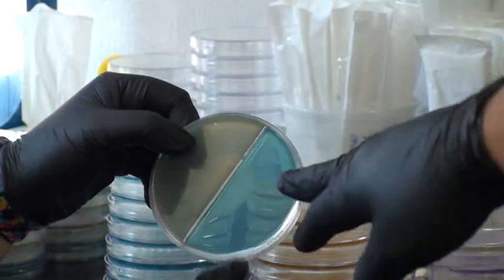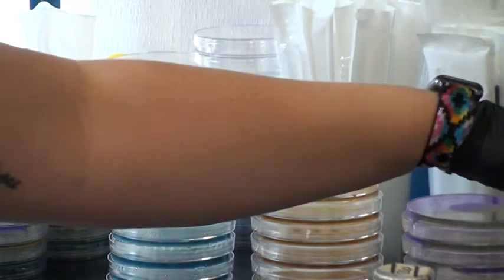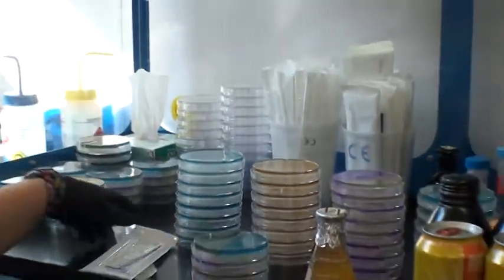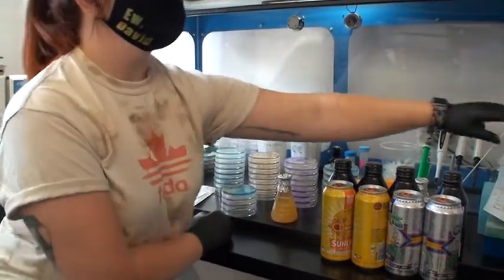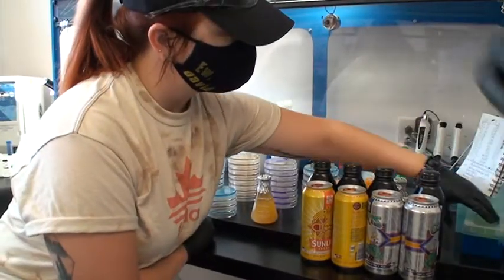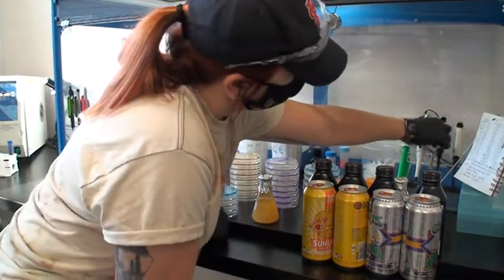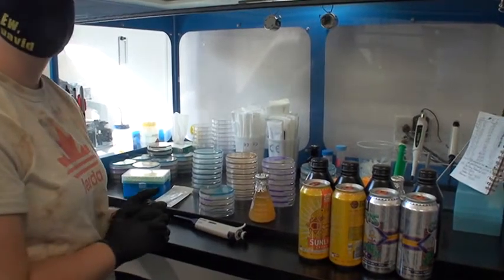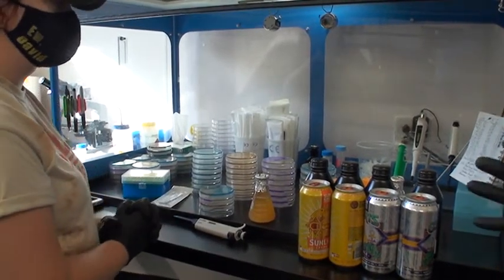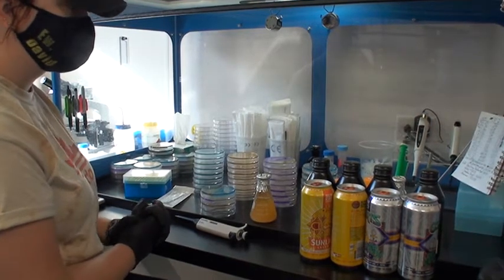The other plate is WLD — it's another general growth media, kind of like our UBA, but it changes color based on the types of colonies, so it's good for colony differentiation. If we see colonies that are all the same color, that's a good thing. If you see six or seven different colors, that means there are six or seven different species — either yeast or bacteria — growing in the product. All of these combined help us paint a picture of what's in there; individually none of them are that great. We need the whole gamut.